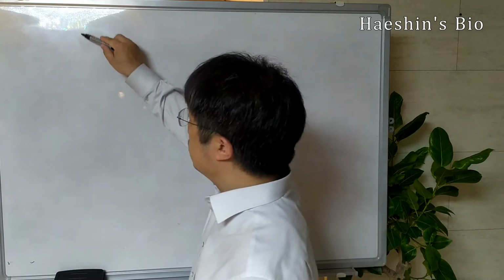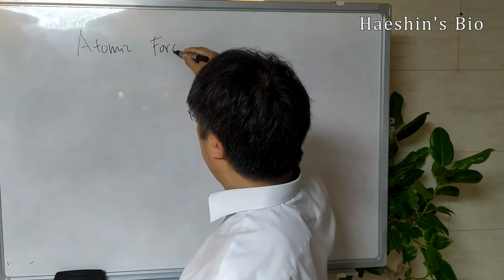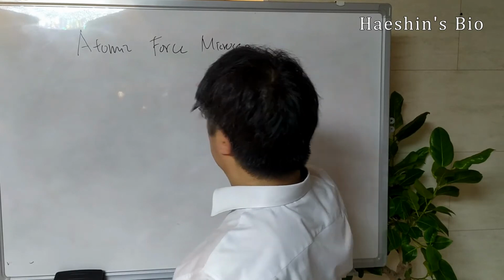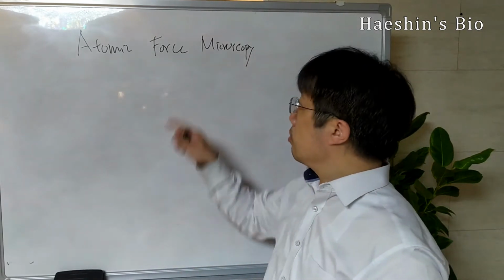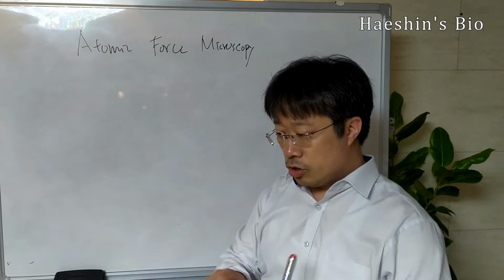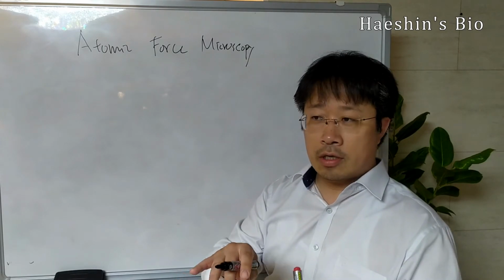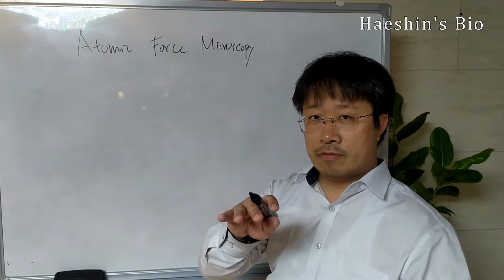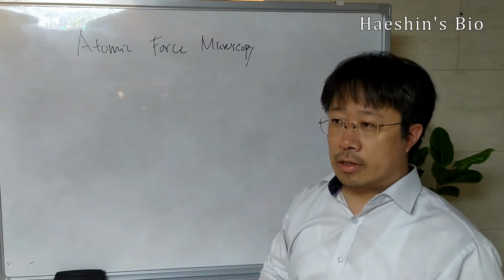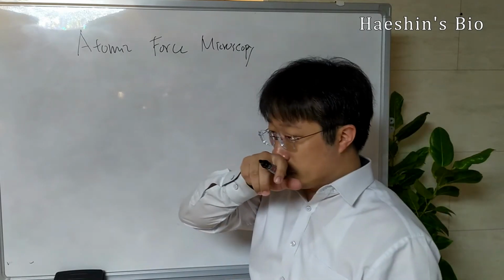So we talk about first atomic force microscopy, the AFM. As the name indicated, this is a microscopy. So you can image the surface, how the roughness of the surfaces, or thickness of the surfaces, and then the general morphology of the surfaces in which biomolecules absorb on it.